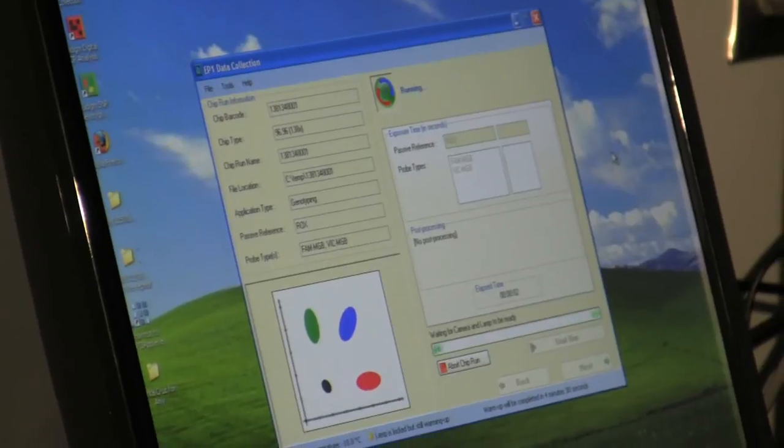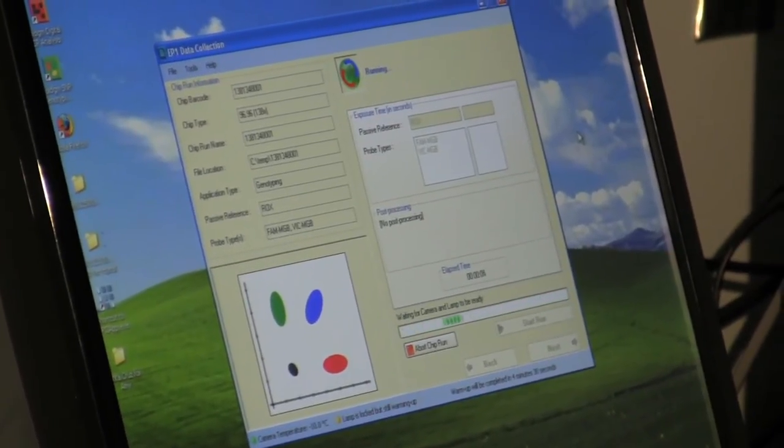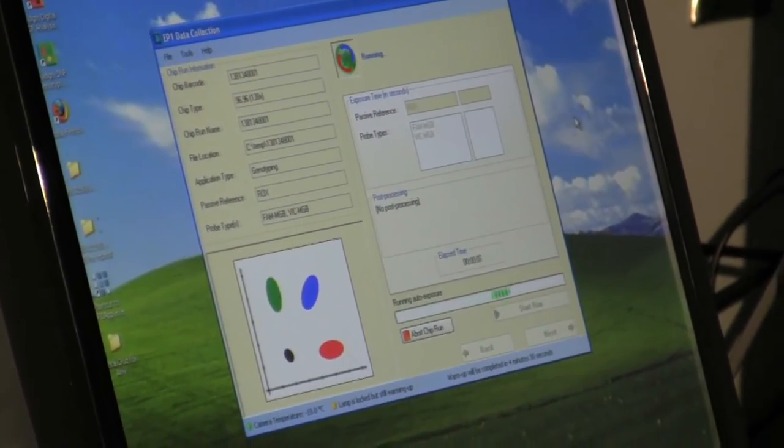And this run time is approximately three to five minutes. And that's all there is to it.